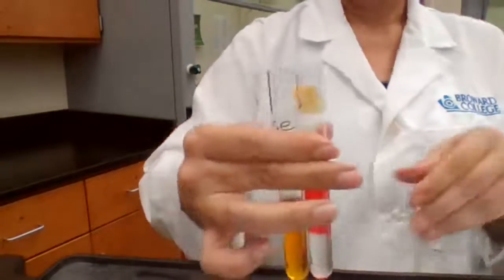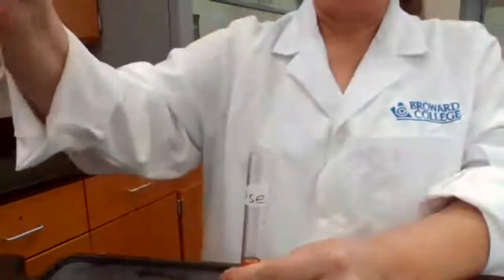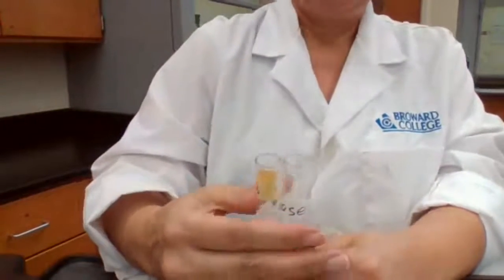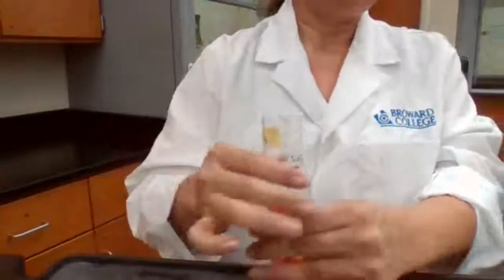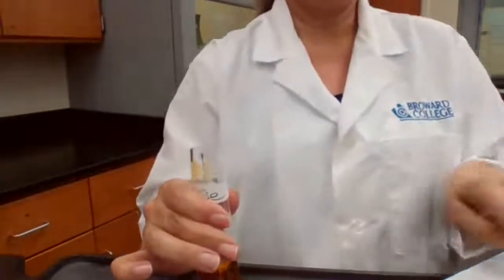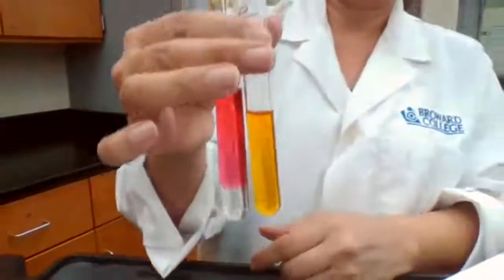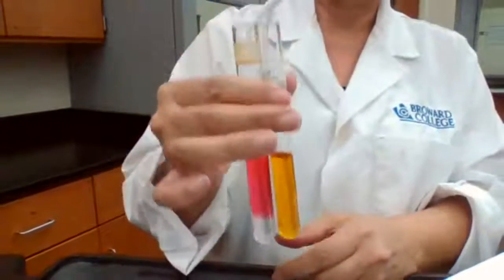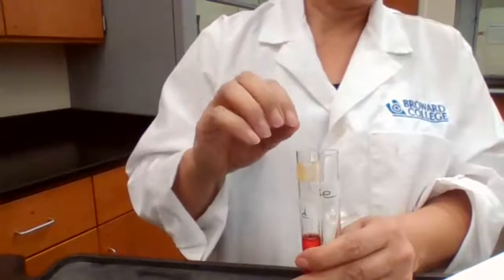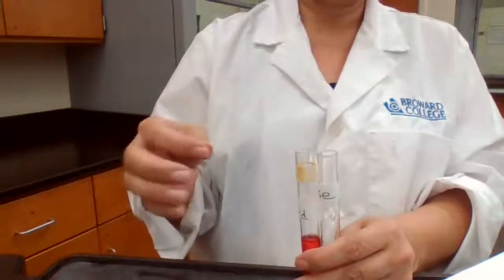Now, what's the purpose of this part of the experiment? It's trying to tell you how the indicator, which is HIn, is going to be affected in acidic solution and in basic solution. The reaction at equilibrium is HIn(aq) giving H+ and In-.